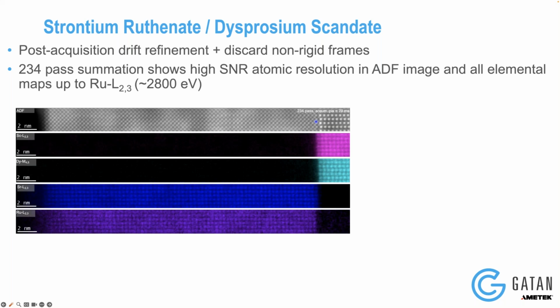But this would have been a hero experiment, even not in a cryo setting. Doing atomic resolution spectroscopy, particularly on a non-Cs corrected system, is a real long shot experiment. But now, with this dose fractionation and the counting technology, you can just acquire one, acquire another one, acquire another one, and it becomes a routine workflow where this just works every time.